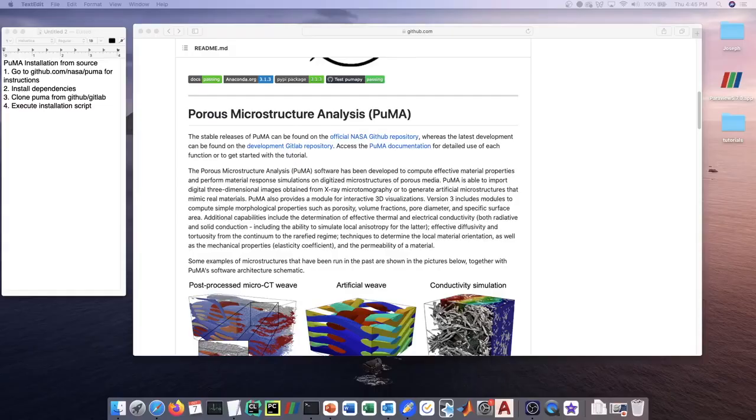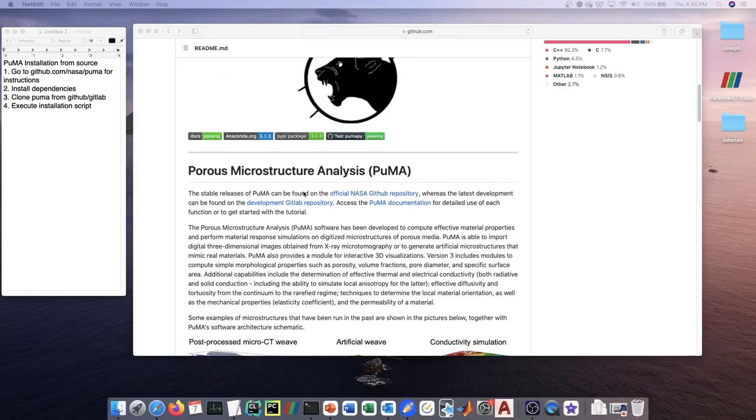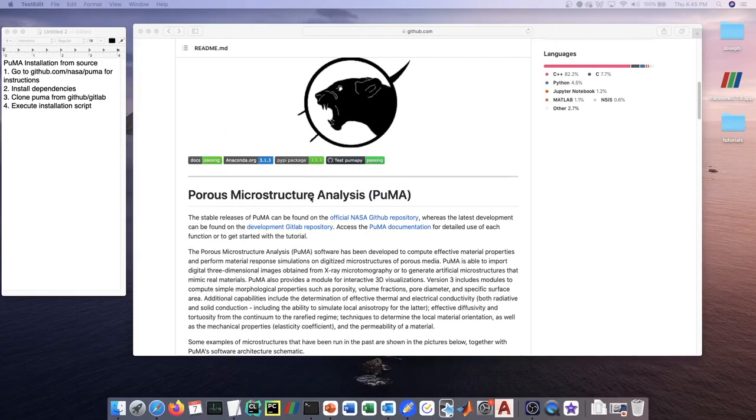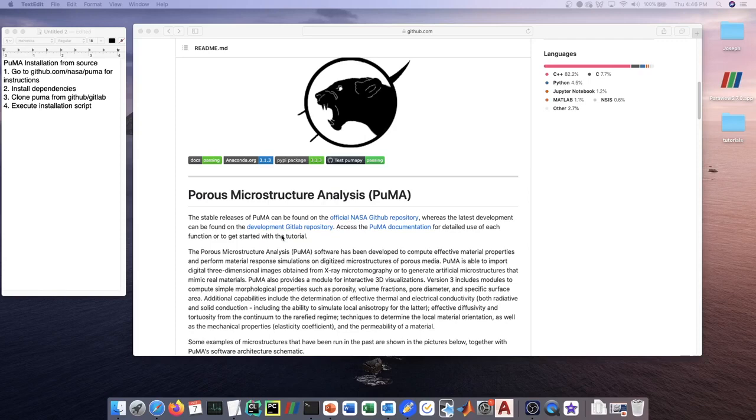In this second tutorial video, I'm going to go through the installation instructions for the PUMA software, porous microstructure analysis, if you want to compile it from source rather than using the Conda Forge distribution.